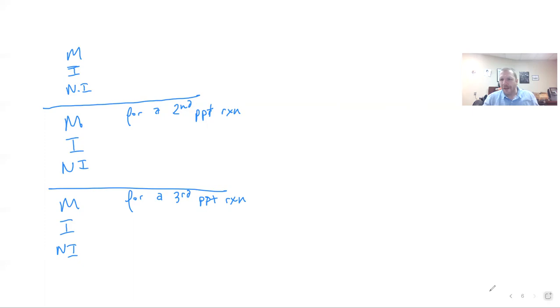Now the last part of this procedure is going to change pretty dramatically, and that is part 3. Part 3 of the procedure asks you to collect 15 milliliters of 2 different solutions. You're not going to do that. Part 3 says, based on what you saw in part 2, which solution combination generates this product? What we are going to do instead is use the information that you got from part 2 and do a calculation for a theoretical yield.